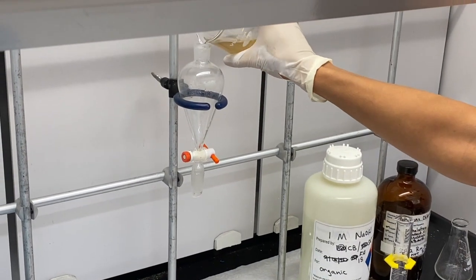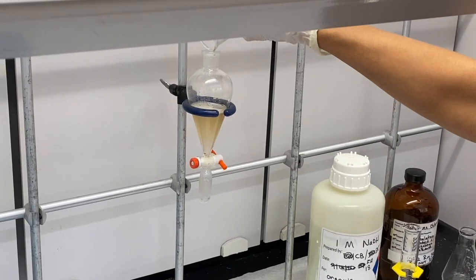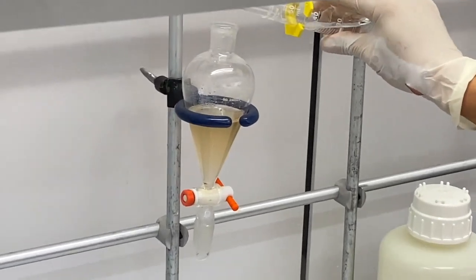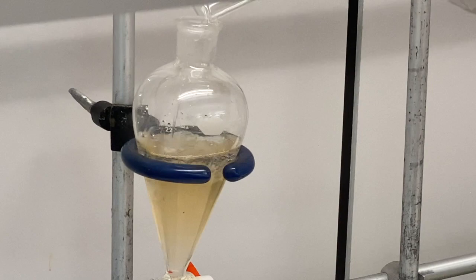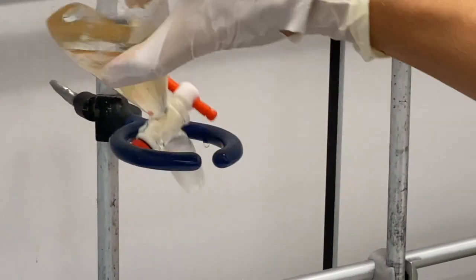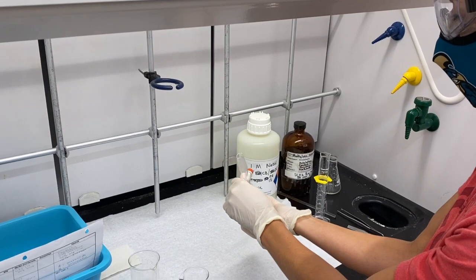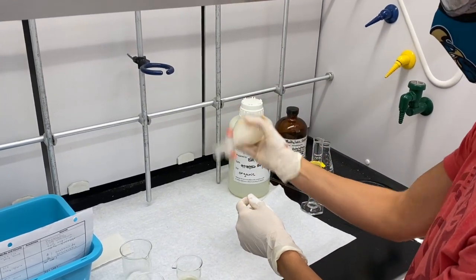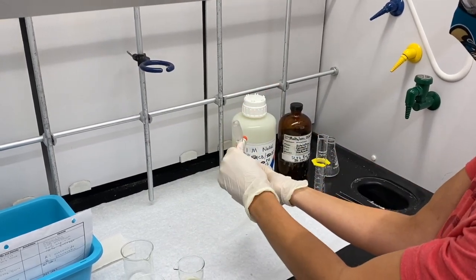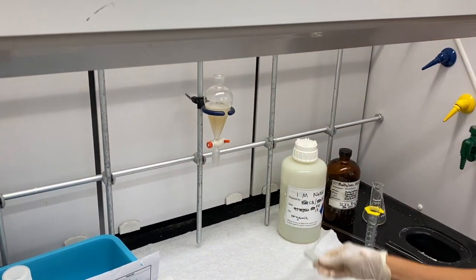I'm going to pour this back in here, and I want to re-extract my organic layer with another 25 milliliters of sodium hydroxide. Pour this in here, and you see again we get that layer. I want to do my extraction again. Take out the stopper and let those layers separate.